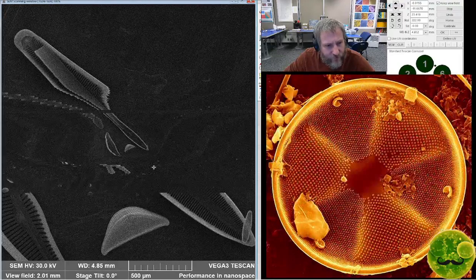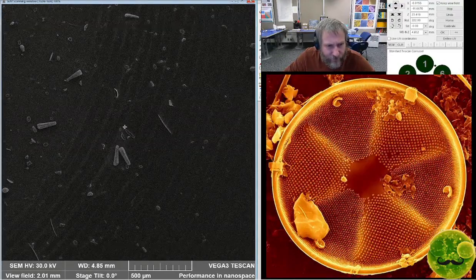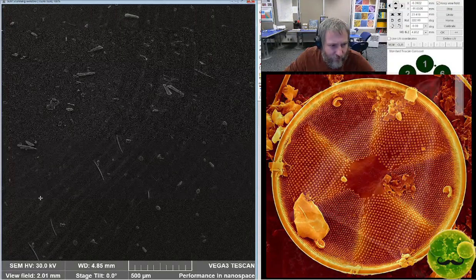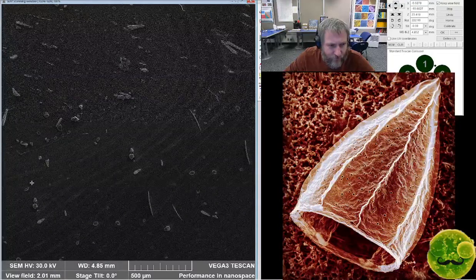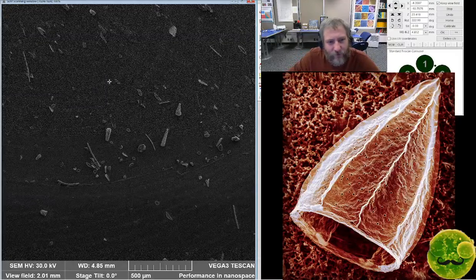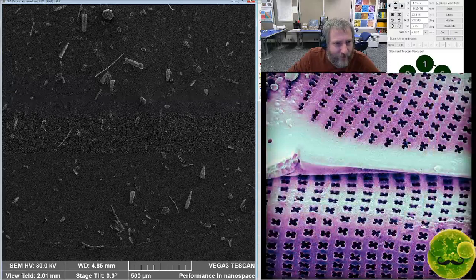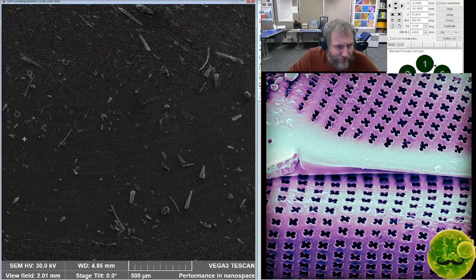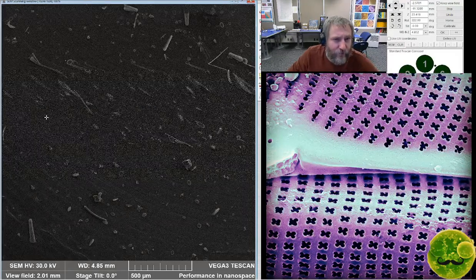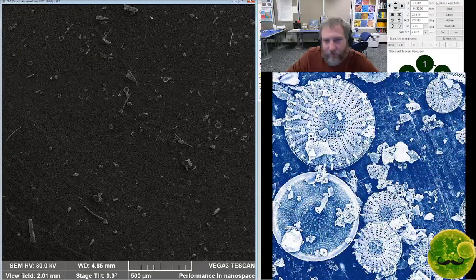That is the unicorn diatom again. There it is, an internal view. There's an external view in profile. There's another one of these guys somewhere around in these samples. It's not Kilomai, and it's not the little unicorn guy. It's a different one. I think it's Africanum. But I don't remember seeing it recently. I think I've seen it in some of these samples before, but it's not in this one.